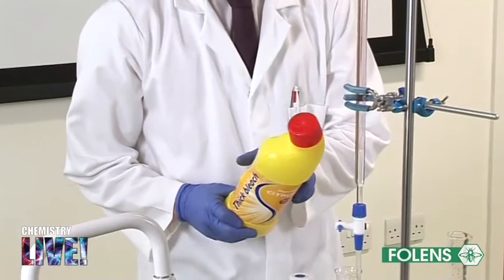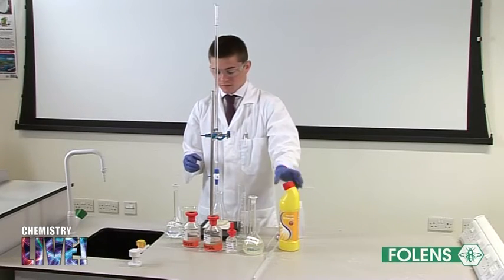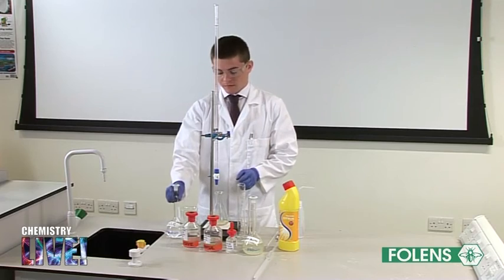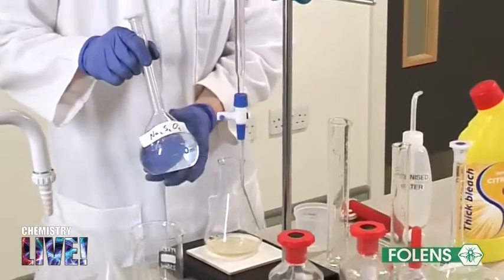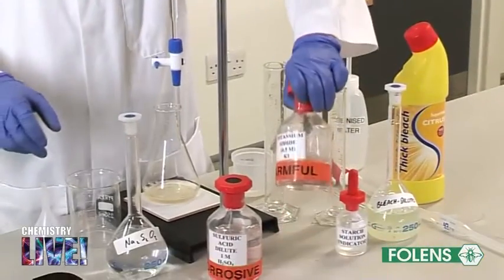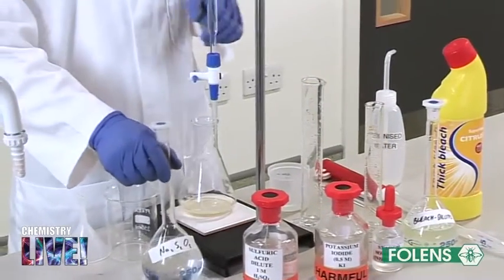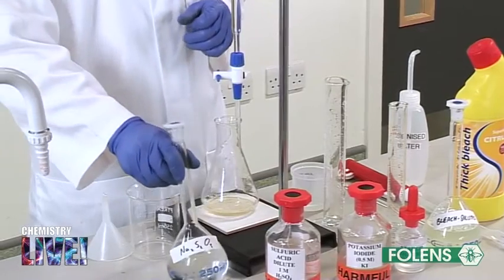To determine the strength of household bleach, a sample of the bleach is reacted with a solution of iodide ions in the conical flask. The iodine formed is then titrated against a solution of sodium thiosulphate of known concentration.